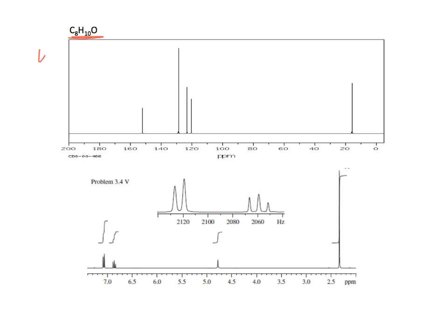C8H10O. So what do we have? Unsaturations equals 8 minus 10 halves minus 5 is 3 plus 1 equals 4. So again, look at this. We've got 4 signals here in a benzene ring. And we have only one way up here at less than 20. We don't really know what that is at this point. If we look at the proton NMR, we see 2 signals. Here's the blow-up of the aromatics, and these look like they're in roughly a 2-to-1 ratio. Then we see 1 over here that is just a little nondescript peak.